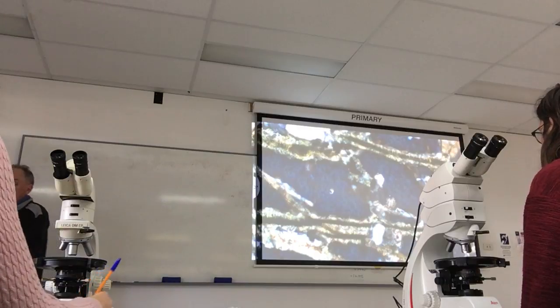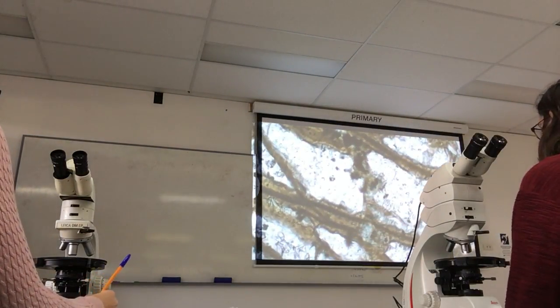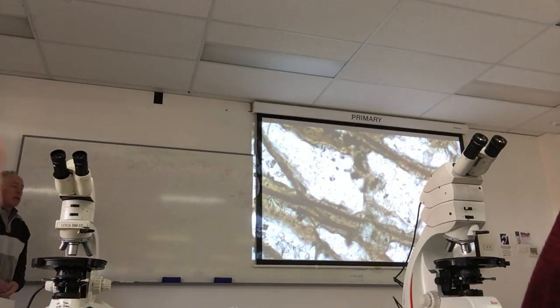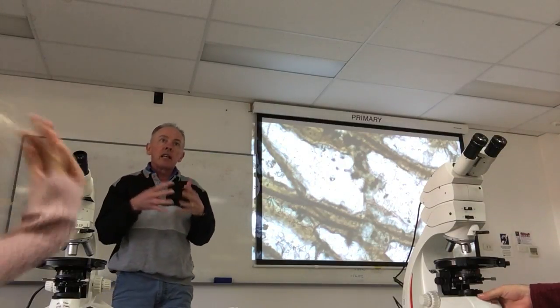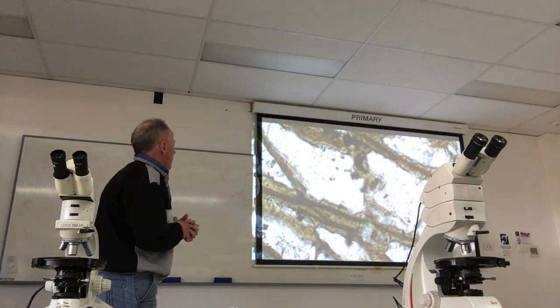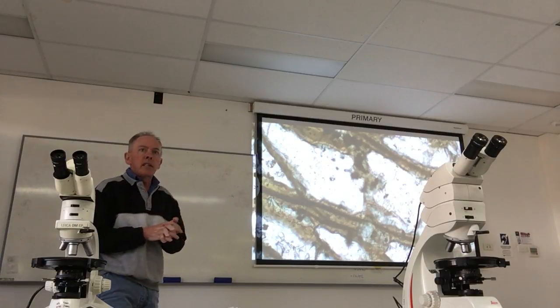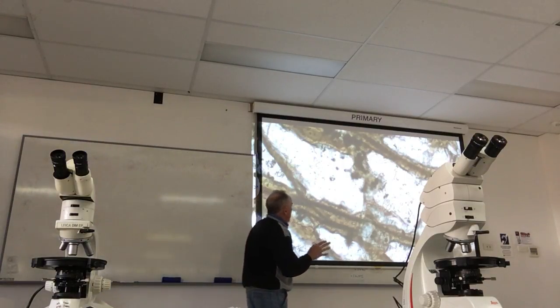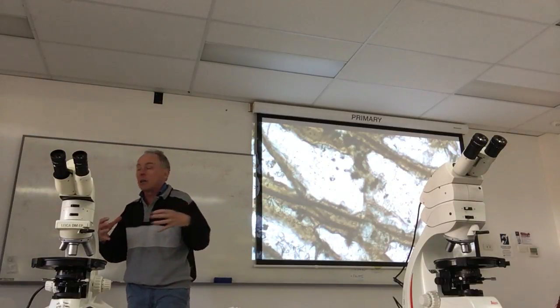Now in this case, I'm not 100% sure what it is. I suspect it's a greenish coloured biotite, because this rock is so potassic. You would expect a potassium mineral as a secondary phase. In fact, I think I did analyse this in the electron microprobe, and it turned out to be a biotite, an unusual composition biotite. What it is doesn't really matter. It's important to recognise that it is secondary and not a hornblende that's overgrown the outside.